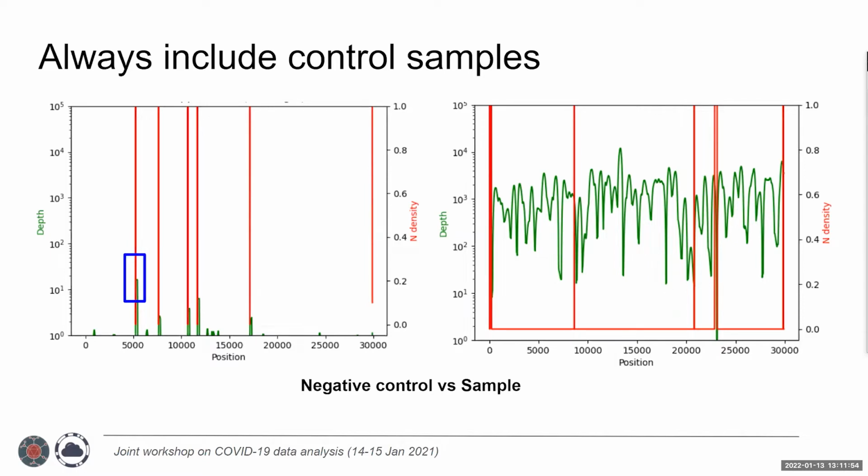On the one hand, you're heavily amplifying your starting material. So heavily that for Illumina sequencing, we regularly go up to 1,000 times coverage, maybe up to 3,000 times coverage. And this is to address issues that are around barcode hopping and variation in primer efficiency that can cause problems. But sequencing at that depth, you need to keep your protocol really clean, and you need to check. The other thing that makes this more complicated is SARS-CoV-2 has a very low level of genomic diversity. So even when there's a small amount of cross-contamination between two lineages, you can get very, very different results.